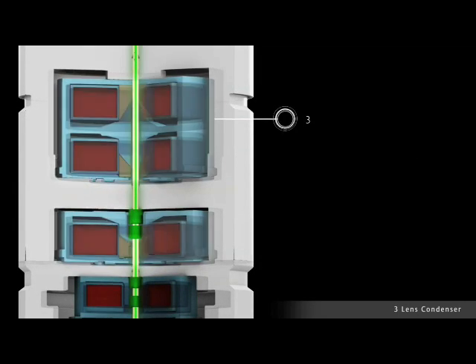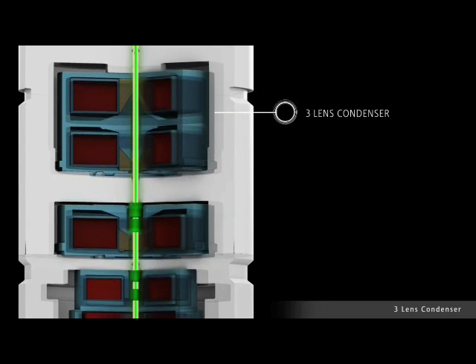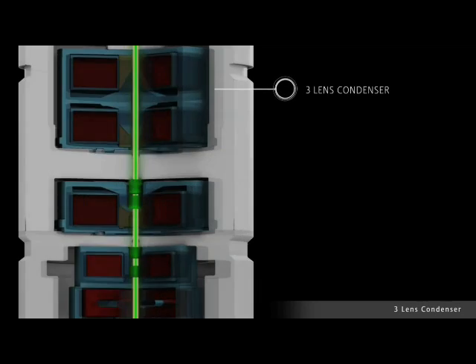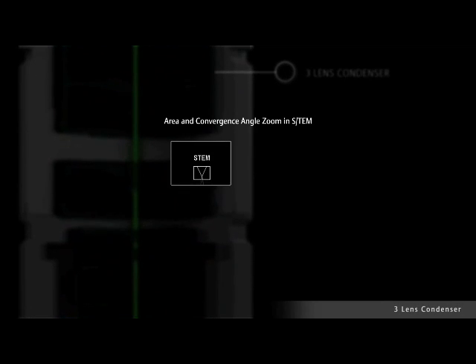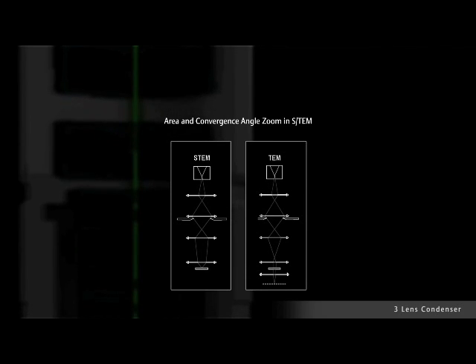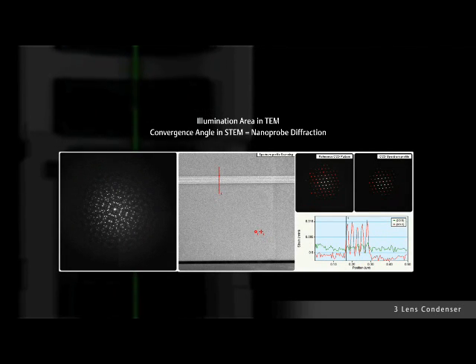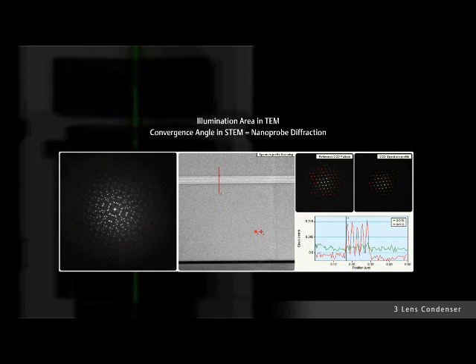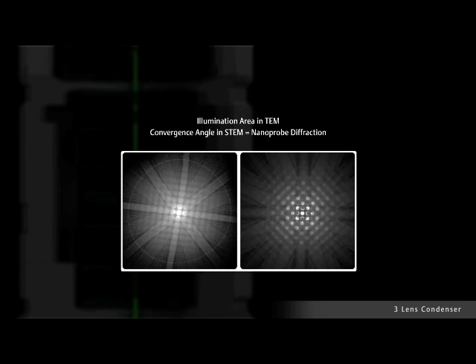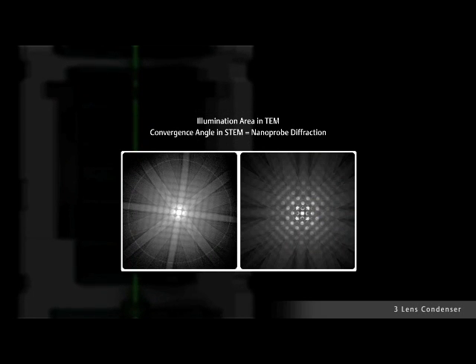The three-lens condenser zoom system controlled by smart optics is optimized for a large range of parallel illumination in TEM mode from nanometers to micrometers. The range in convergence angles is extremely broad for focused probe mode applications, from ultra-small angles in nanobeam diffraction applications used in strain measurements, to large convergence angles in CS-corrected HR-STEM imaging or convergent beam electron diffraction CBED applications for structural research.